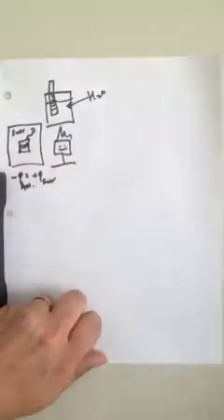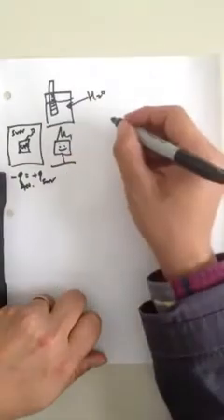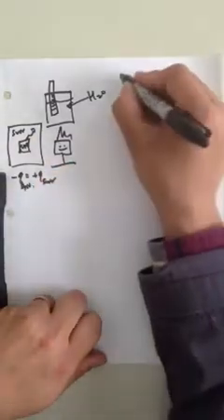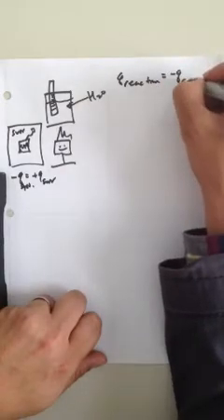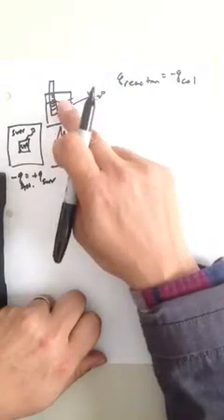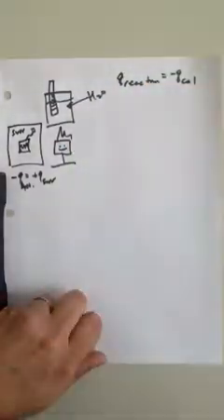The question is, how much heat is in here? Okay. Well, how much heat from the reaction? So in our case, the heat given off by the reaction is going to be negative the heat absorbed by the calorimeter. Okay? So we'll measure the heat from here and see what it tells us about the energy that's in here. Okay? Knowing that it's not going to be 100% efficiency.